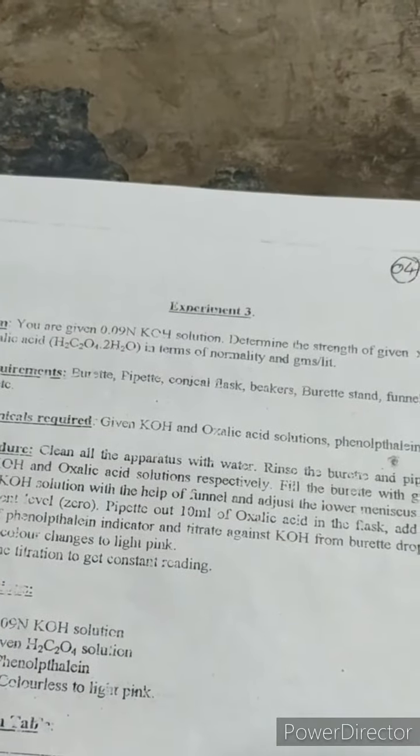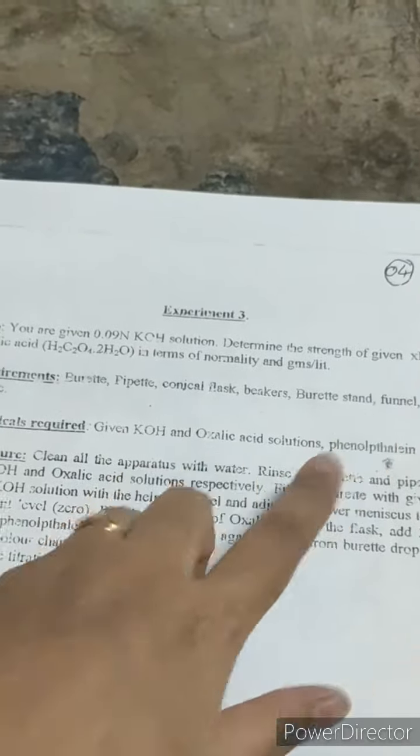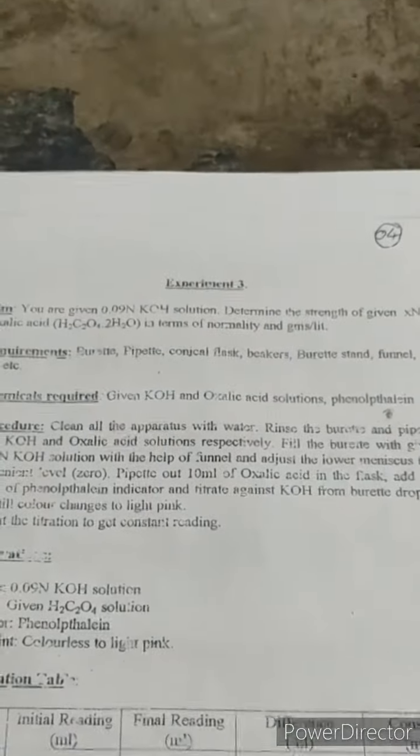These are the requirements: burette, pipette, conical flask, beakers, stand, funnel and tile. These are the chemicals required. Now we'll start with the procedure.